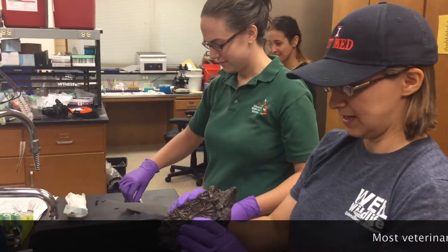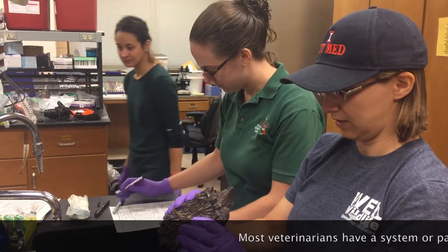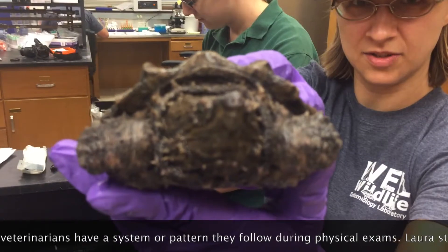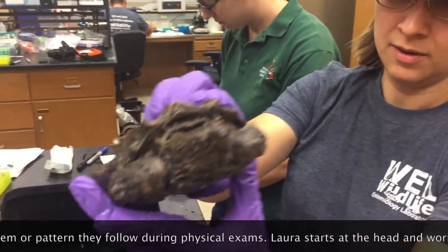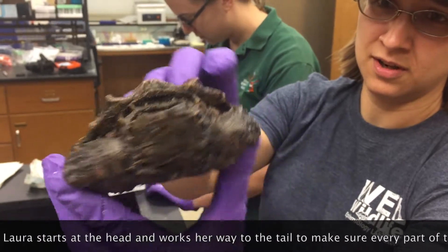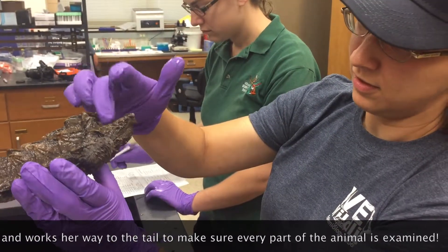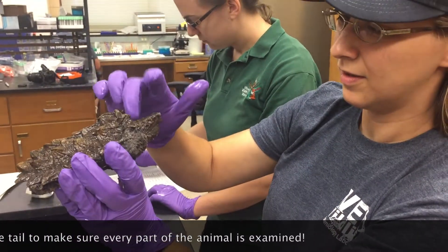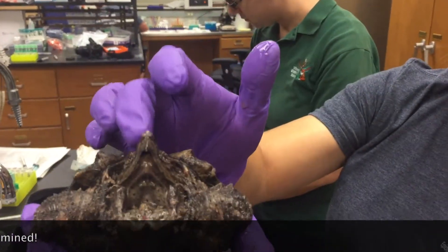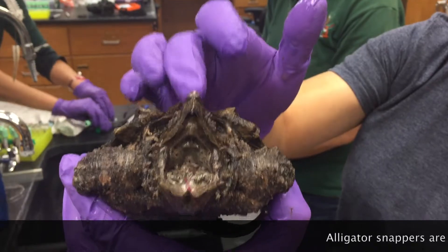Okay, for physical exam, we're going to start at the front, look at the nose, then closest to the front, and see his nostrils are a little bit asymmetrical. We're going to look at both eyes and make sure they're bright and clear. No swelling or discharge. We're going to look inside the mouth. There we go. And make sure the oral cavity looks pretty normal, which it does in this guy.